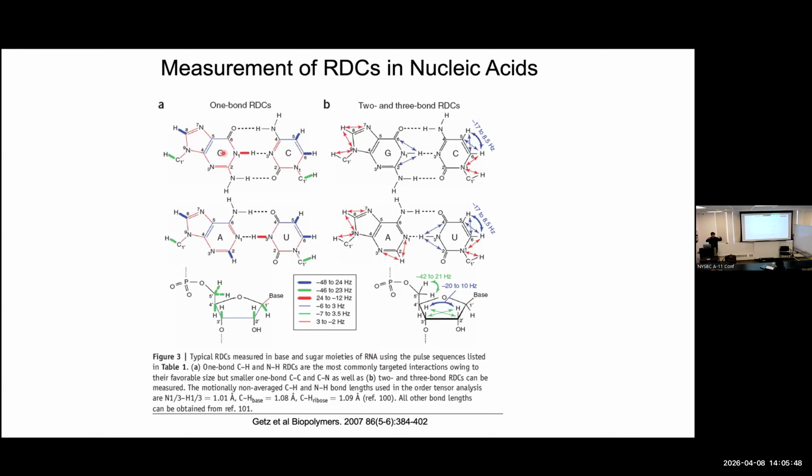And the minute you go to CN, what's the bond length, by the way, for NH and CH bonds? Anyone know? Every protein NMR person should know, in my opinion, what the NH bond length is in angstroms. It's a big question, because the NMR people go crazy about including vibrational frequencies, the quantum effect. What is your favorite? And by the way, everybody has a different answer. I bet you have a different solid state answer. What's your answer for the NH bond length? 1.03? Oh, 1.03. Mine is 1.04 for angstroms.